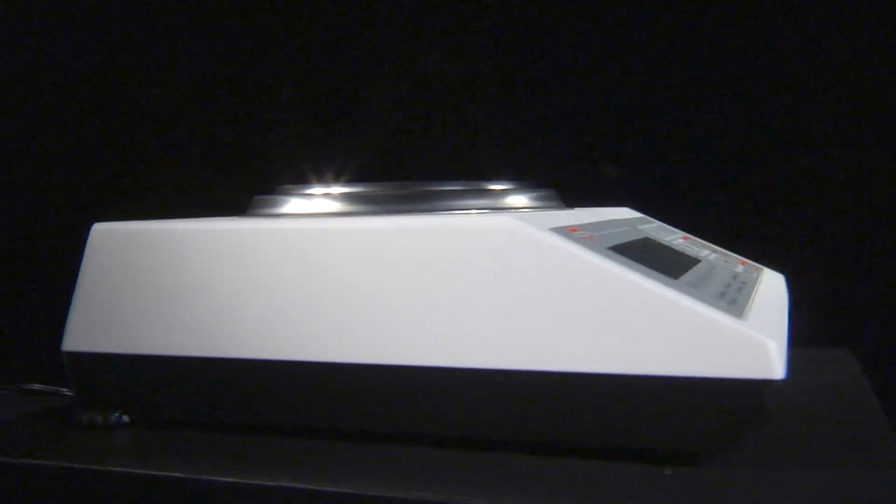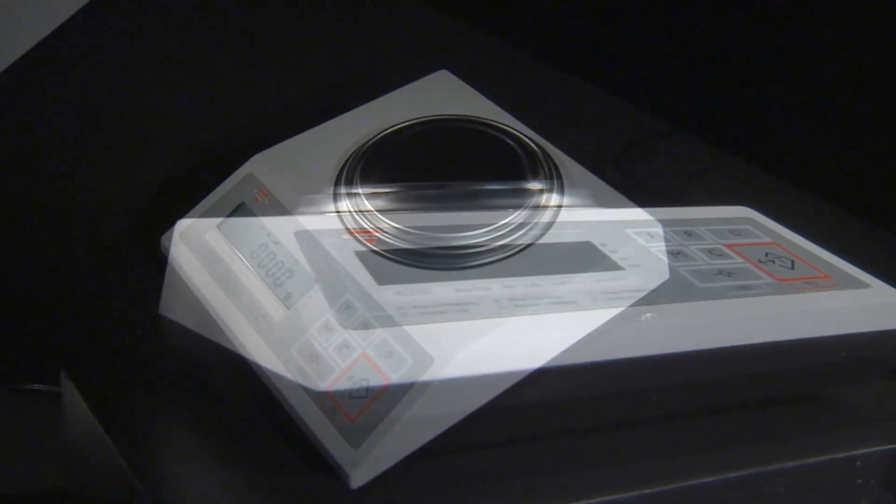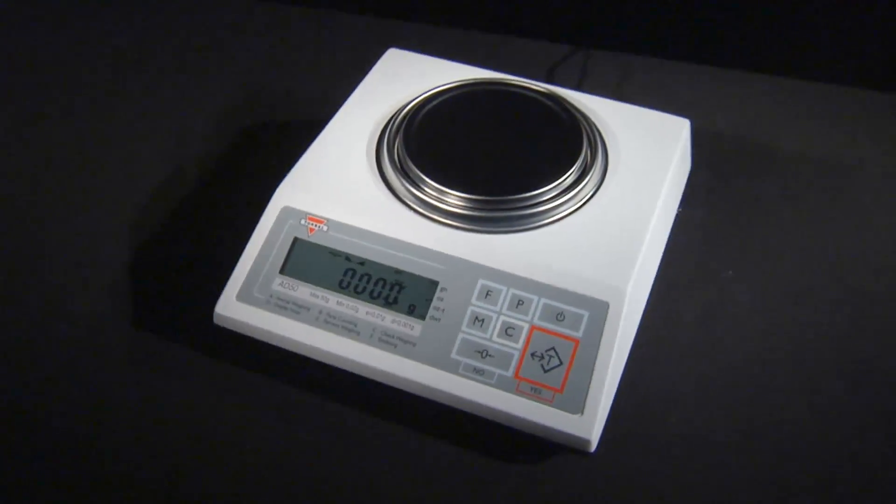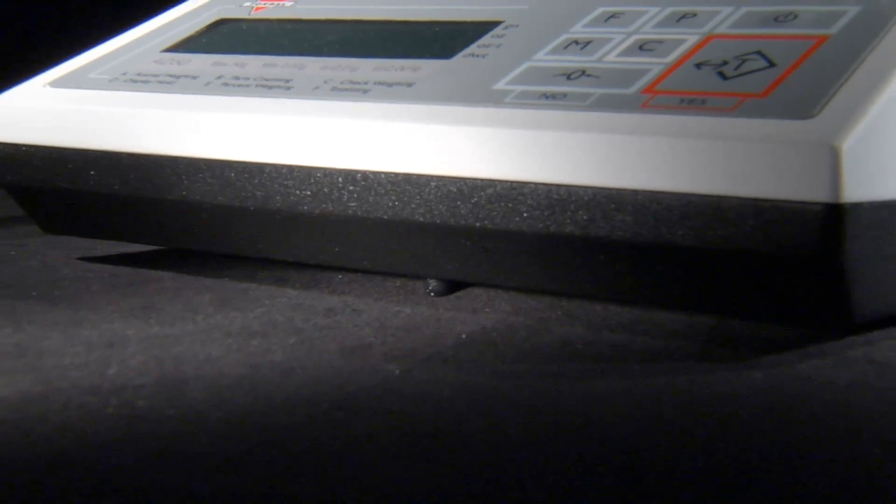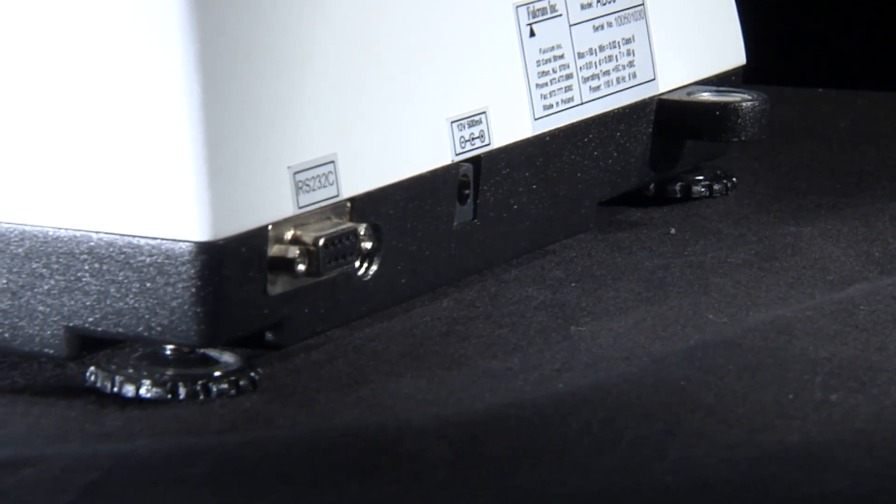All AD scales are built with a full die cast metal housing that guarantees durability and long operating life. The base uses a tripod support system that consists of one fixed leg and two adjustable legs located in the rear.